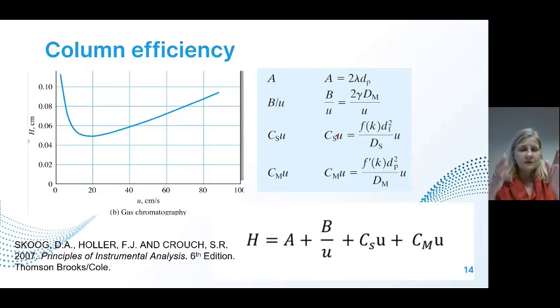the MS is able to determine different compounds according to the retention time and the mass to charge value of that compound. But you cannot have 10 compounds eluting as one peak. So what we really want is a good separation, where we have baseline separation of our components as far as possible. And now this is just a little bit of theory behind choosing our flow rates and choosing our columns to obtain the best separation that we can.